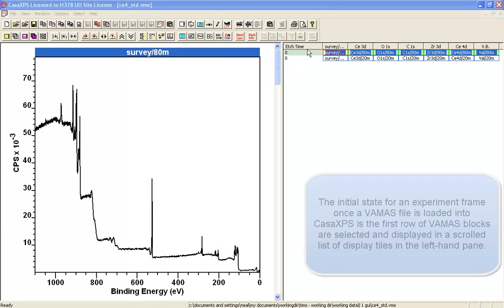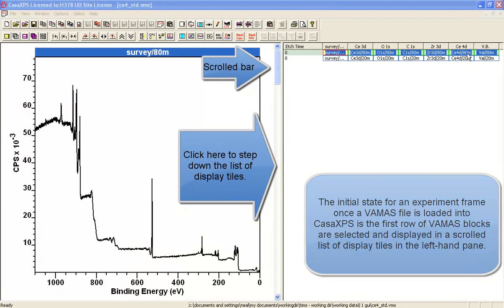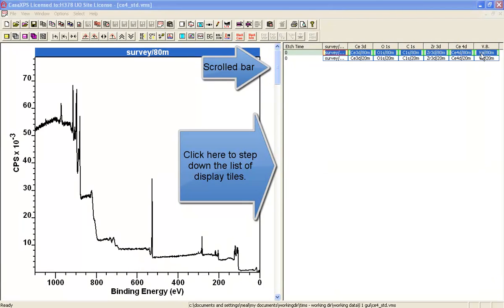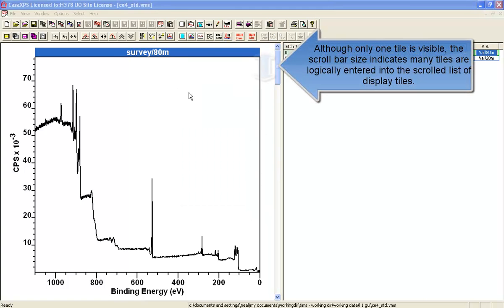When a VAMAS file is first opened, the first row is selected as indicated by the blue background to the block names, and each selected block is displayed in a scroll list on the left-hand side.